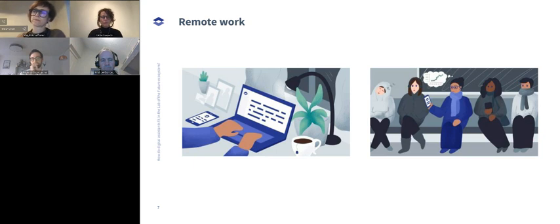But ultimately, if you ask what's the biggest barrier to adopting these kinds of new digital technologies, we're not really competing with other digital technologies. We're actually competing with paper and pen. And I think the biggest barrier to adoption is just the familiarity and convenience of writing something down, sketching something down in your lab book or on paper. And that, I think, is generational and cultural.